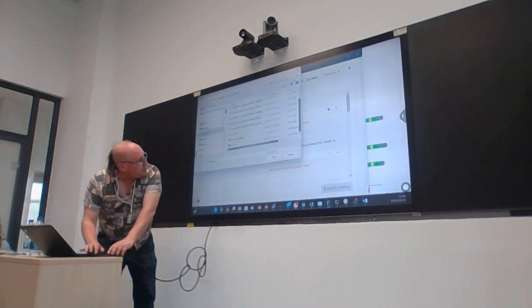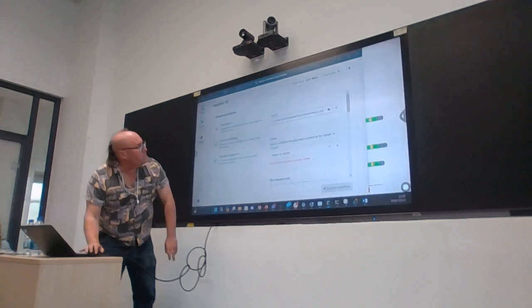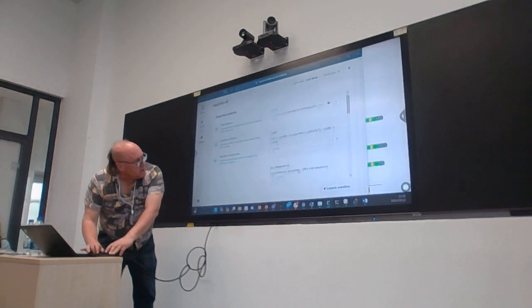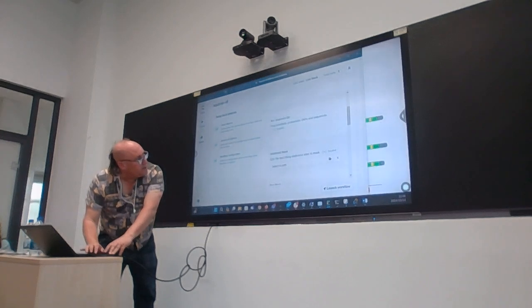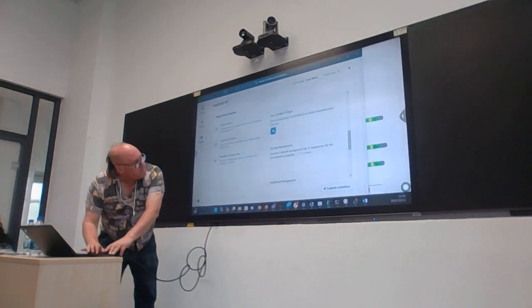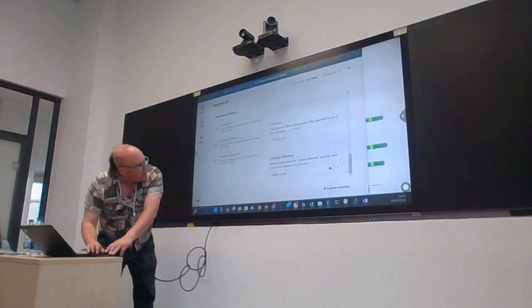This is correct. And this is Clade 2. Yes, I want to flag that, and I want to run phylogeny, and I want to run background. This should all work. Launch workflow.